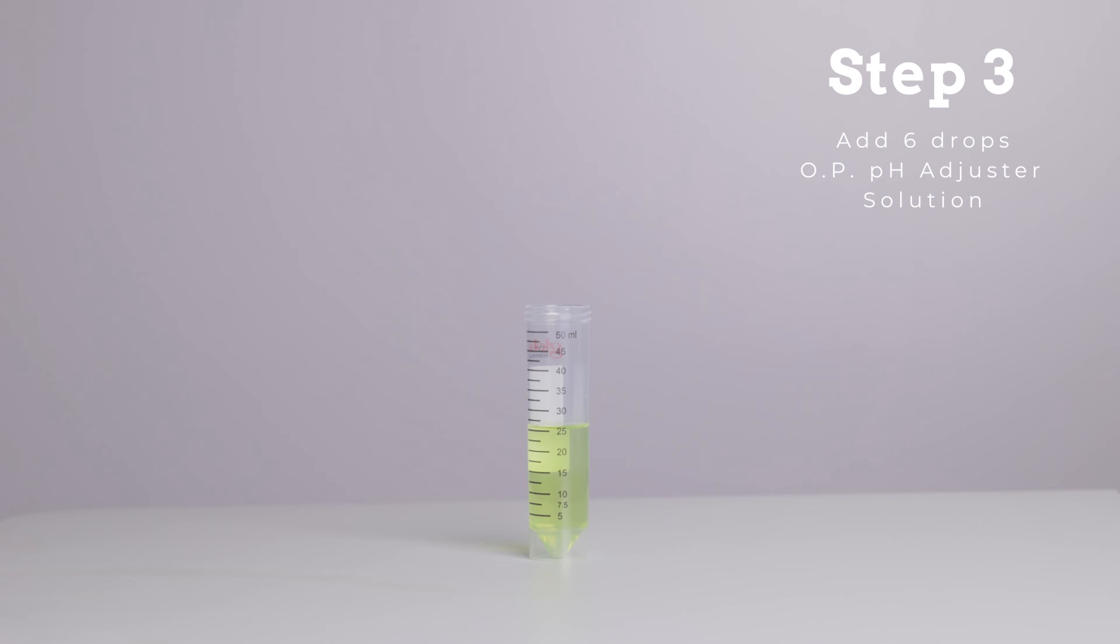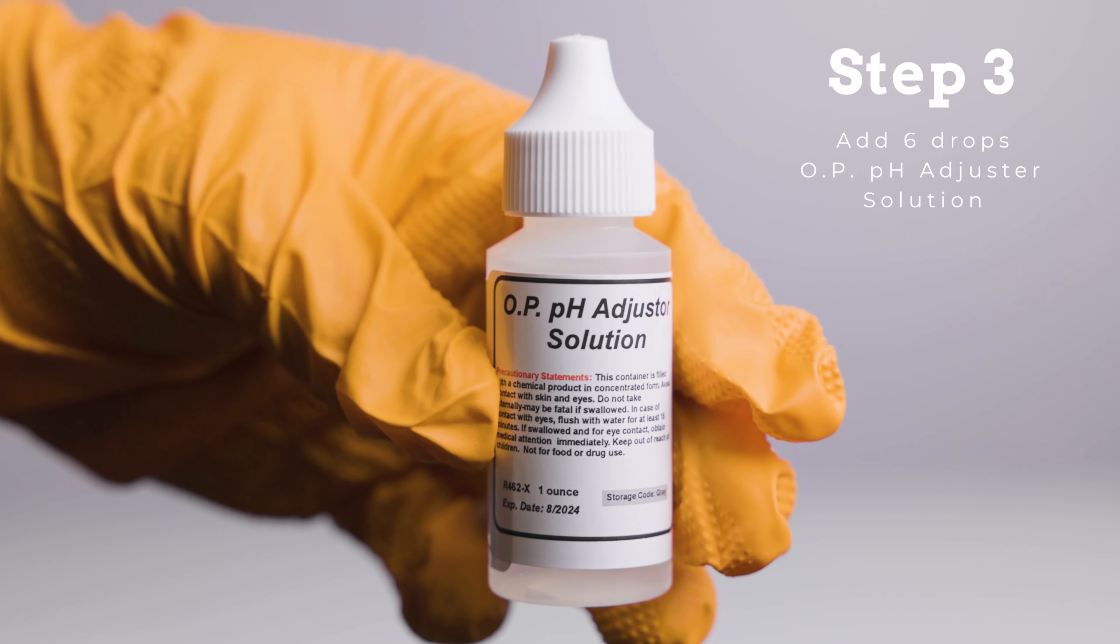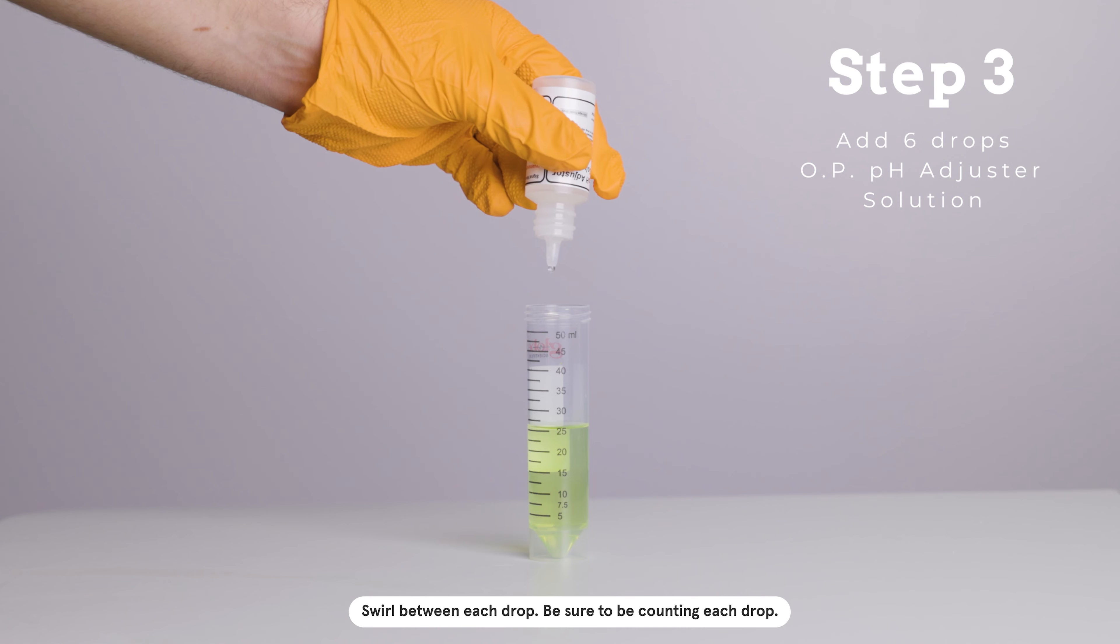Step 3. Add 6 drops of OP pH Adjuster Solution to the sample. Mix well. The sample should now be lime green in color.